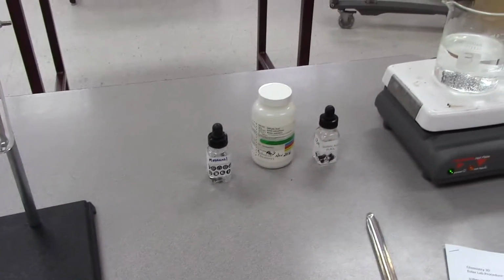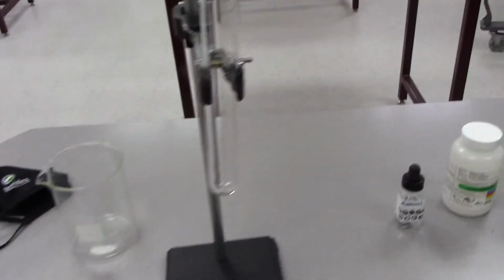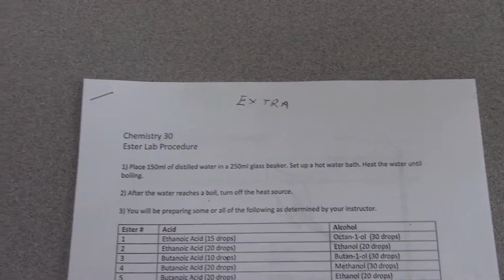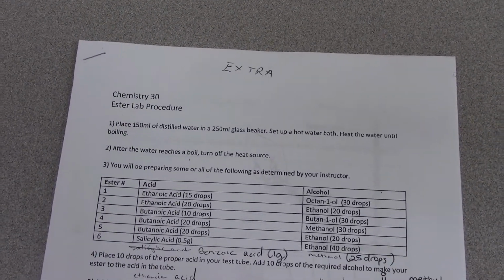Hi Chem 30. I'm going to do an ester demo. I posted this handout in the content section of D2L. Look under organic chemistry. It'll say Ester Lab.